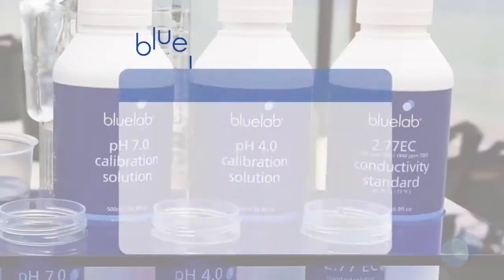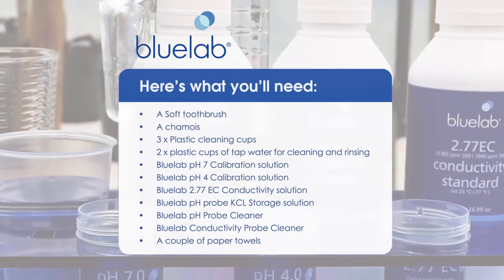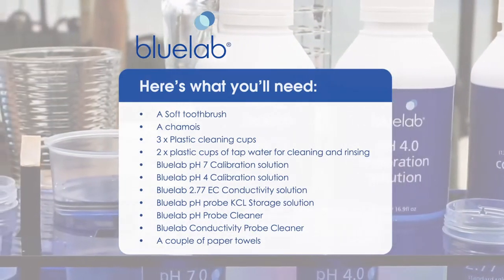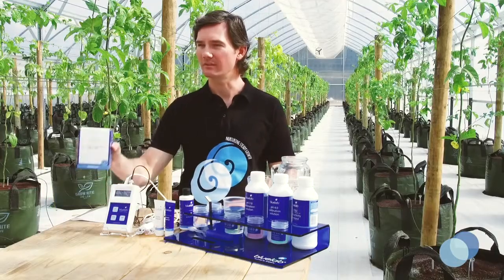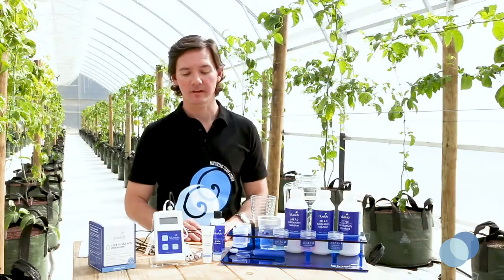Here's what you'll need for cleaning. Bluelab pH and Conductivity Probe Care Kits contain everything you need to clean and calibrate your probes. Let's get started with cleaning the pH probe.